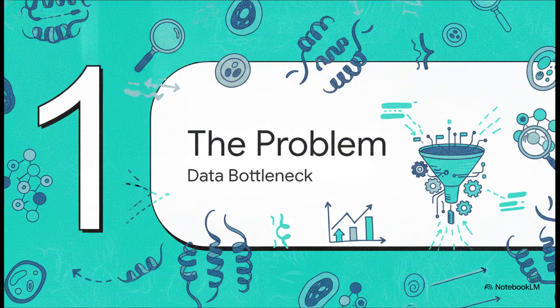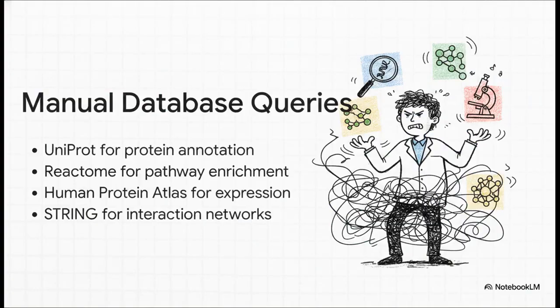The problem. So imagine you've just finished a statistical analysis and you have a list of significantly regulated proteins. Now what? Well, to actually understand their biological significance, researchers usually have to manually query a whole range of independent databases. You're going to UniProt for your annotations, Reactome for pathway enrichment, the Human Protein Atlas for spatial expression, and then over to String to build out interaction networks.